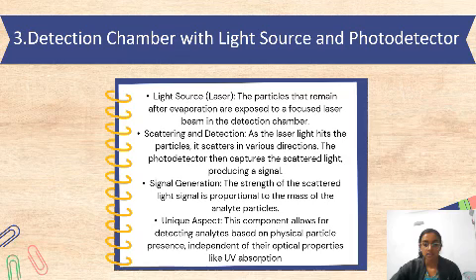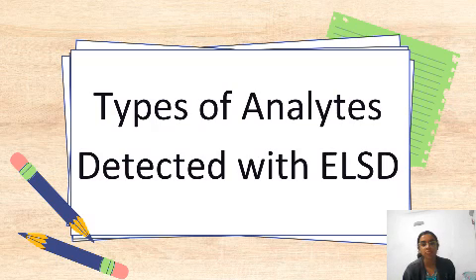ELSD's design allows it to detect a wide range of compounds without the need for chromophores or other optical characteristics. This makes it a universal detector for non-volatile compounds in liquid chromatography. Let's move forward and see the types of analytes detected with ELSD.